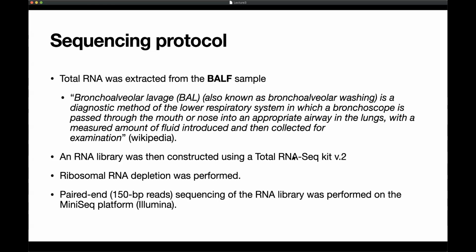Then use a standard RNA sequencing kit. That's produced by large biotech companies. I don't remember who it was, it might have been QIAGEN, but it's shown in the paper, you can see what it is. So this is standard, it's basically a kit, you just follow the protocol, right? If you're a trained lab scientist, you can do this.